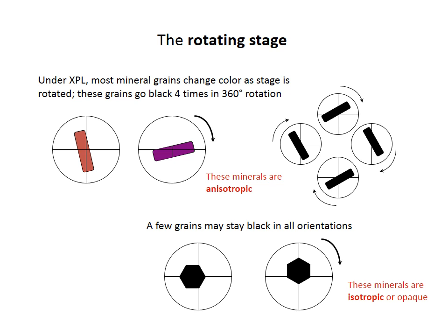One, it can be opaque. So that would be black under plain polarized light, one filter, or cross-polarized light with both filters inserted. So those we don't end up being able to draw many conclusions from. Or it could be a mineral that transmits light, but isotropic, so like the fluorite we worked on in lab. In that case, there's no wave splitting, so there's only one refractive index, there's only one direction the light moves through the crystal, and all light is therefore blocked when the analyzer is inserted, because there's no splitting of the light. Or it can be anisotropic and at extinction because of stage rotation.